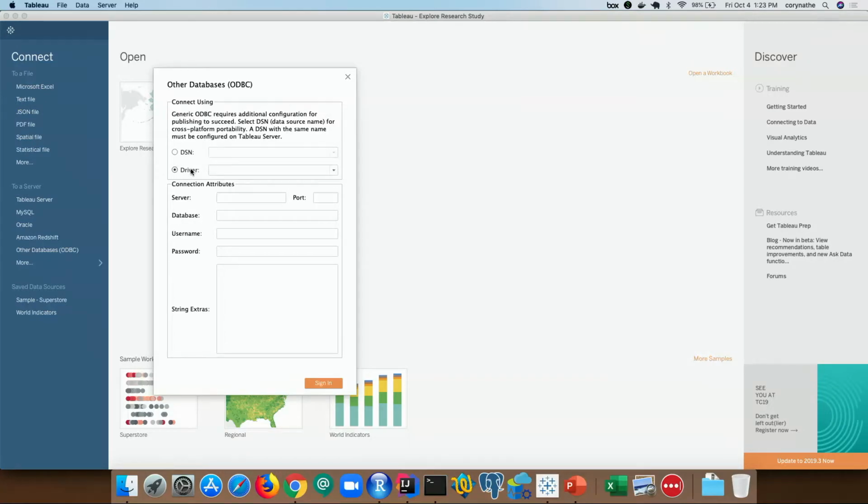So if I select that option to connect to my local host, I can use the Postgres SQL Unicode driver. In this case, I use localhost, but this would be the name of your LabKey server. From the LabKey server itself on the admin console page, I didn't show this, but I had previously set it up. You have to enable this as an option from the LabKey server side. The default port is 5435, I believe. We'll find out in a second. But that can be configured as well from that admin console site level page.